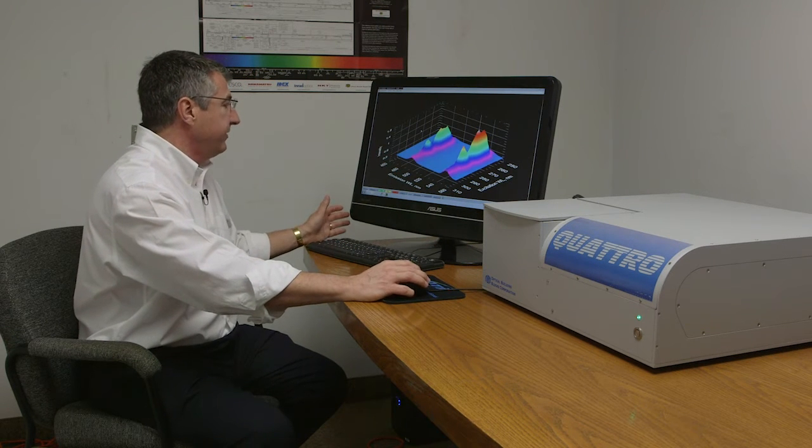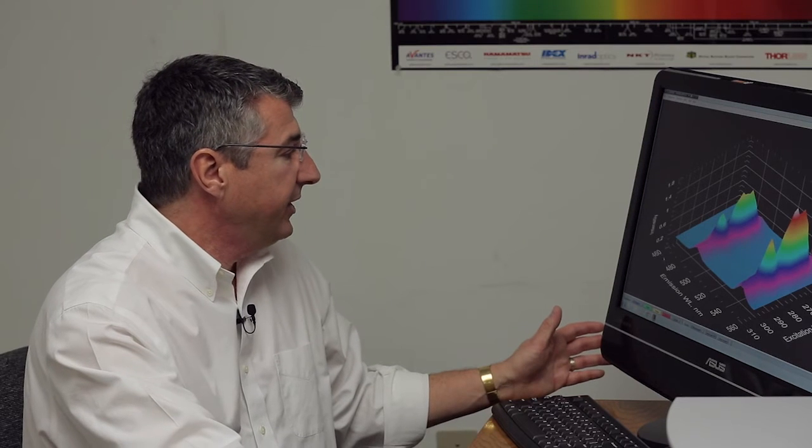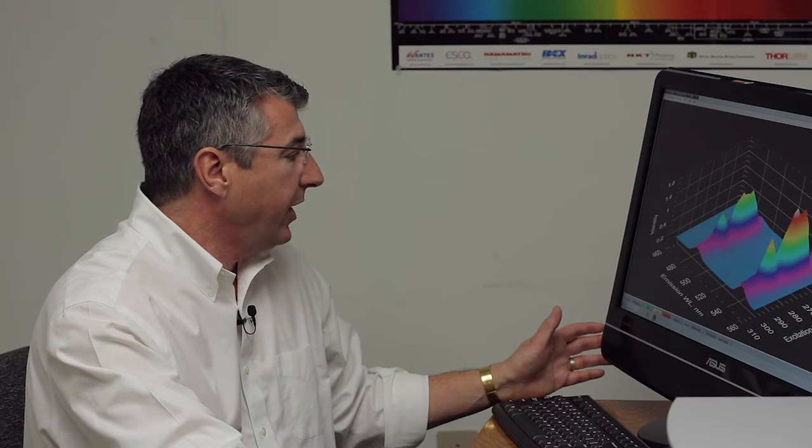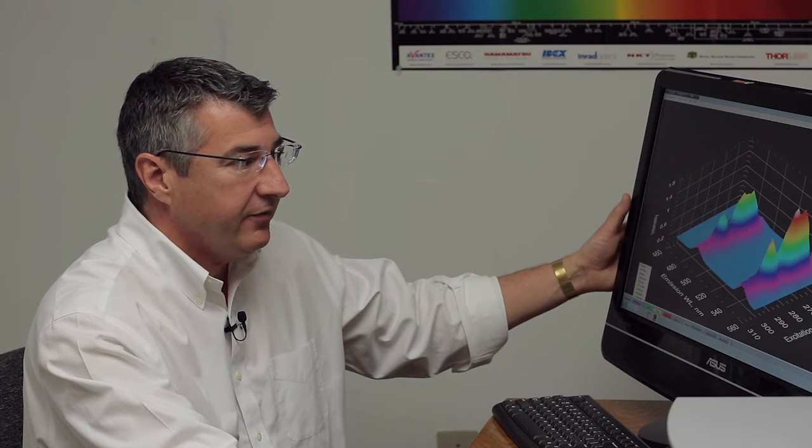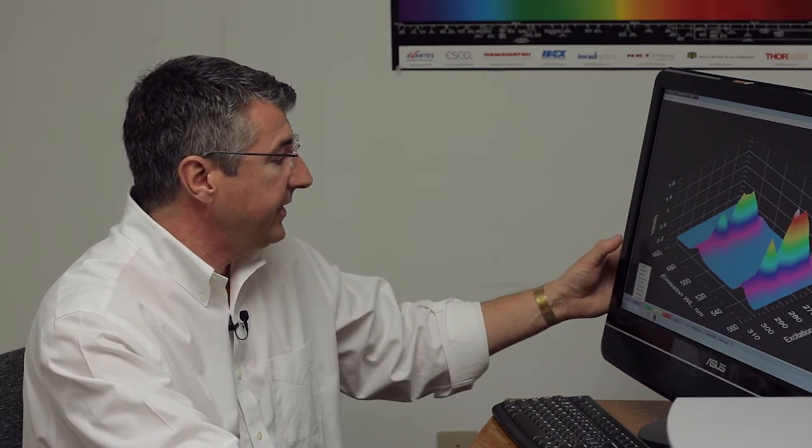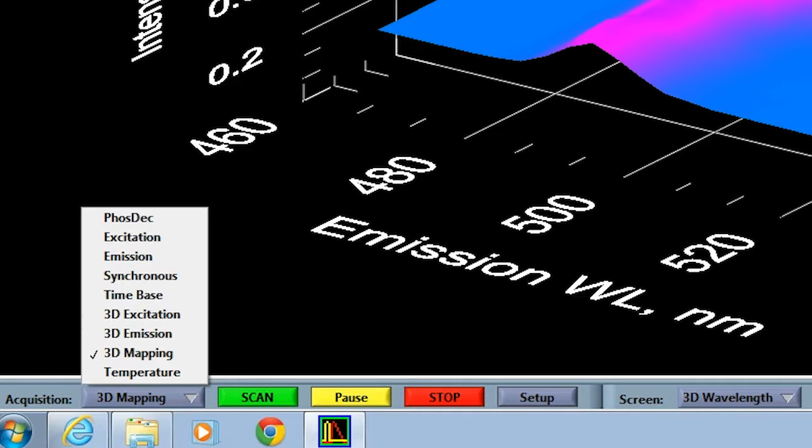The software is really extremely simple to operate. It allows you to acquire a variety of different kinds of fluorescence and phosphorescence spectra or decays. You can see here from the pull down there's a lot of choices that are available to you but primarily the instrument is designed to look at spectra, typically fluorescent spectra, but it can also be phosphorescence spectra because we're using a gated approach.